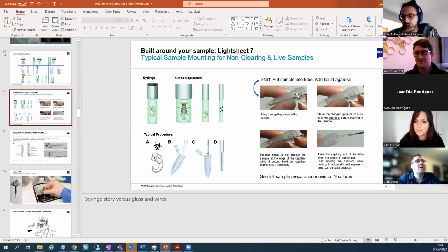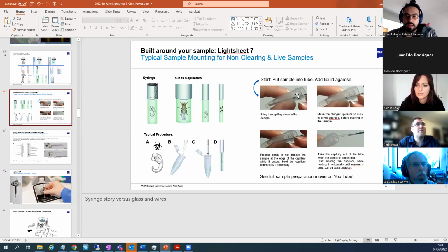Yeah, I work with avian bones with clearing methods, and one of the problems I found when using confocal microscopy is that bone is a really dense tissue, and usually you have some level of problems with antibody penetration and another level of problem with laser penetration. With thicker bones, you have a harder time getting a clear image to the center of the bone. Is there a way to solve that with Lightsheet, or do you have some sort of Lightsheet?